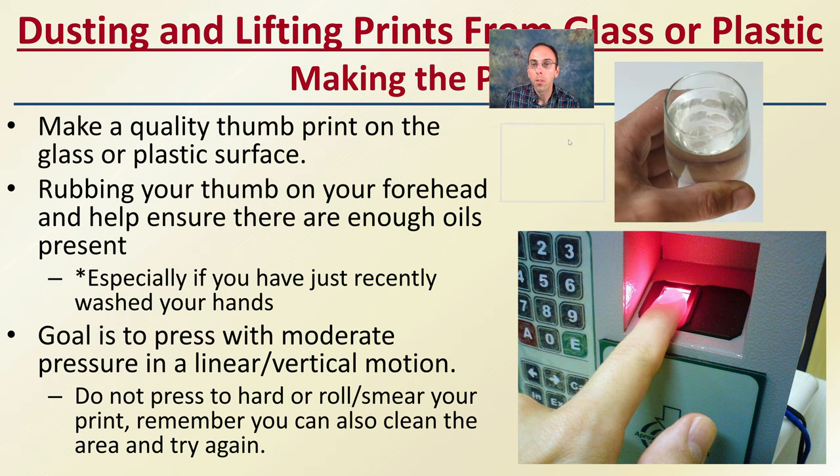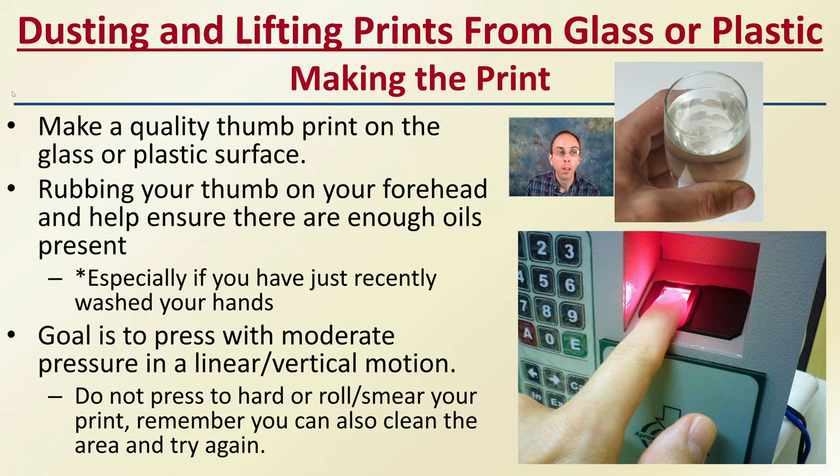So, dusting and lifting prints from glass or plastic. First, you want to make the print. To make a quality thumbprint on the glass or plastic surface, you want to rub your thumb against your forehead to help ensure there's enough oils present, especially if you just recently washed your hands. The goal is to press with moderate pressure in a linear vertical motion on the actual surface. Don't press too hard or roll or smear your print. You can also clean the area and try again. A lot of students try too hard initially — just grab the glass like you normally would, and odds are you're going to transfer just enough oils without ruining the print.